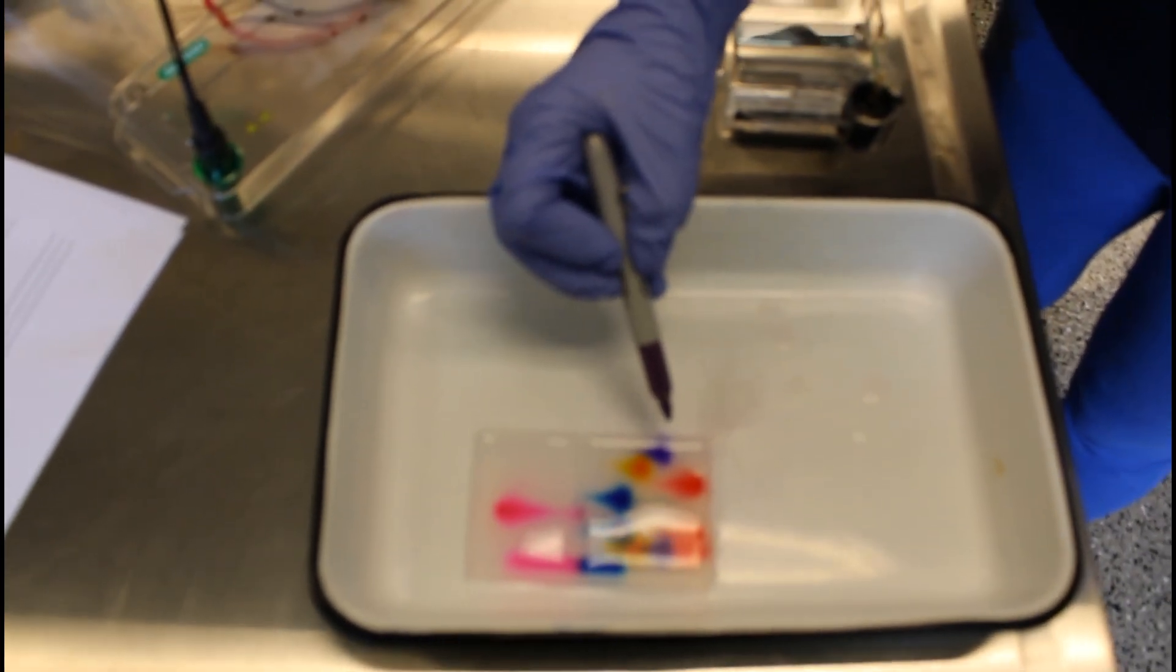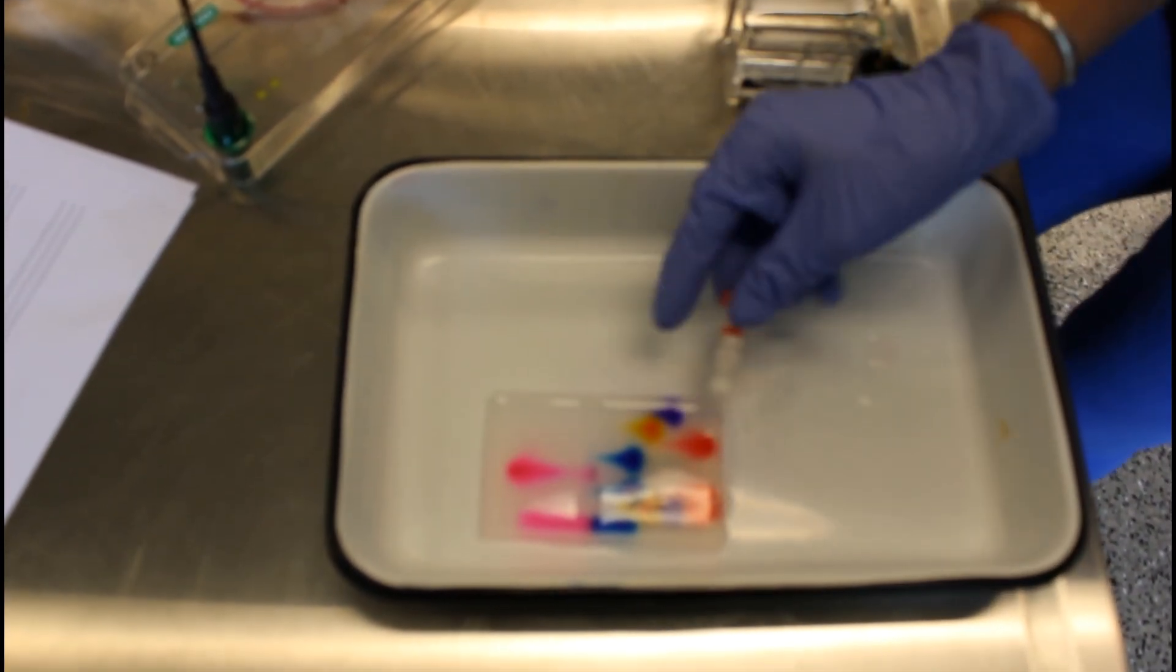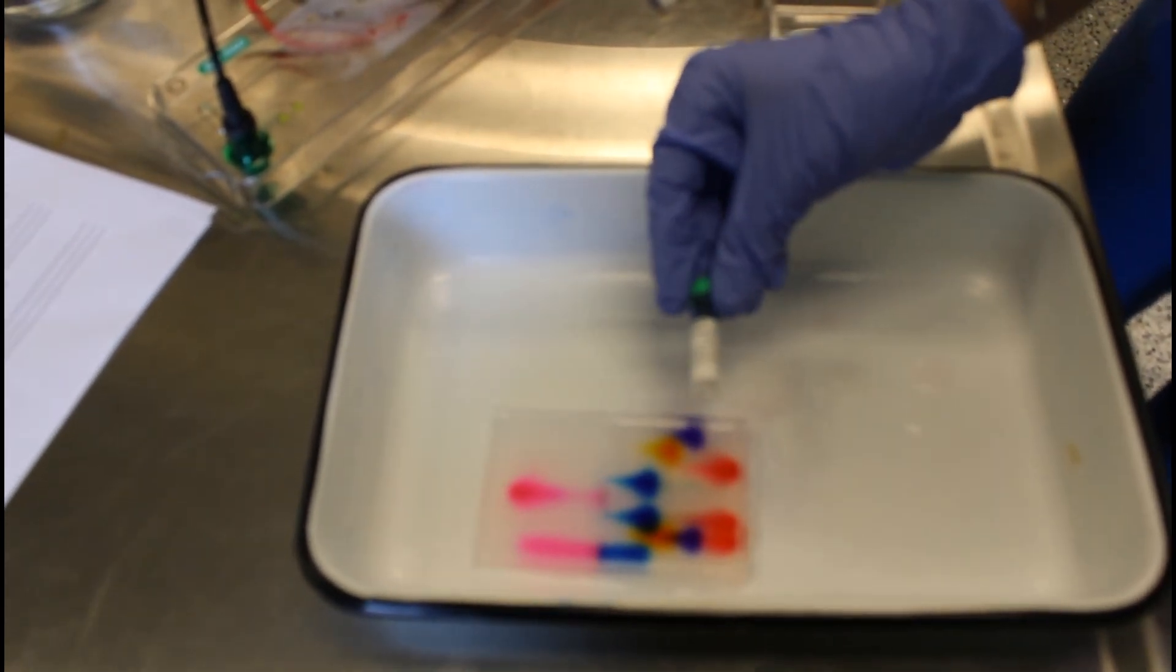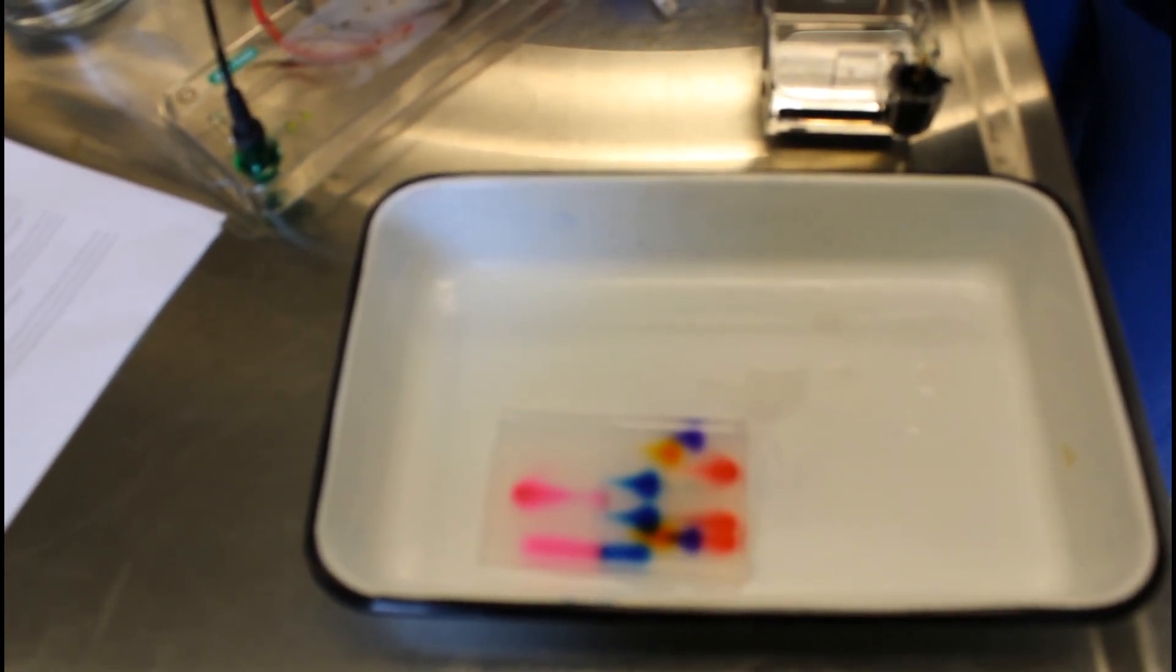So just to remind you, and I know that you have a little diagram of this on your lab already, but this well was the well that had our bromphenol blue. So that was in this first well, we can see this single purple spot. The second well was the one that had our methyl orange, so we can see that single spot of orange dye. Our third well had our PG in it, so we can see that's this kind of coral colored spot. Our fourth well had the xylene cyanol, so we can see this beautiful blue color that didn't travel very far. That must be a fairly large molecule.